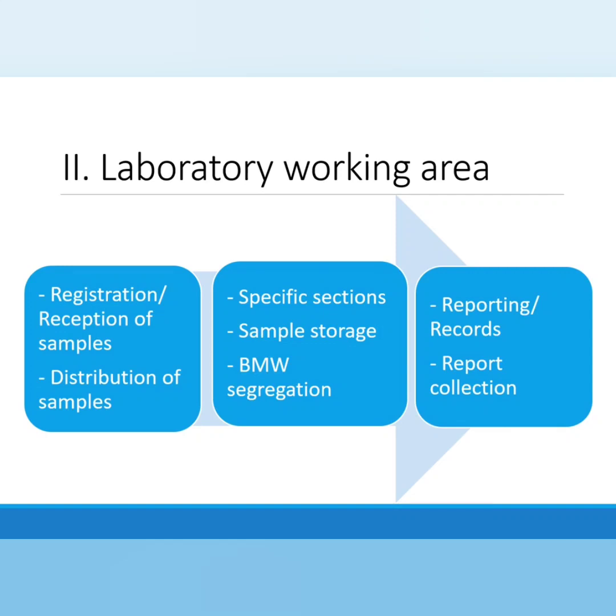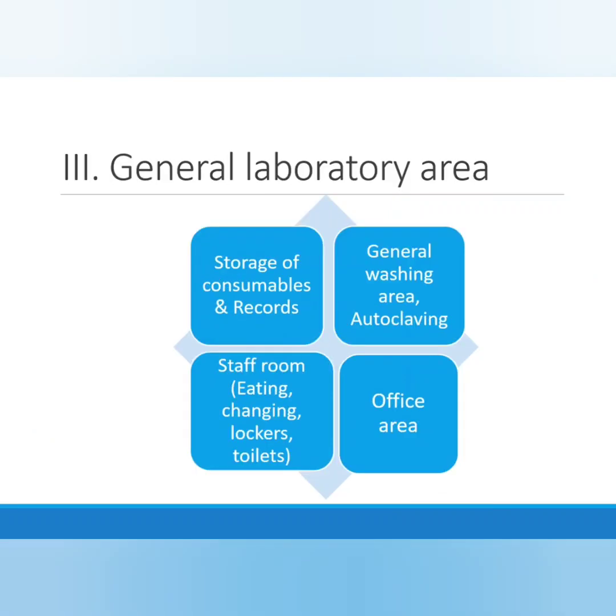Then, a clean area where the results are validated, verified, and the reports are signed. And finally, a report collection counter. It may be located adjacent to the specimen reception counter but must be separated.